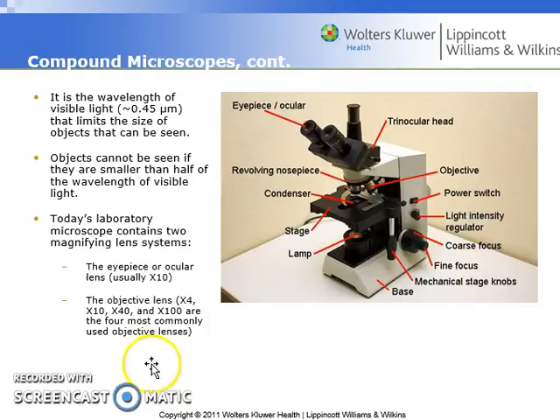So most of these lenses are especially beneficial to allow us to visualize the bacteria that's situated on the slide we're interested in. But we can't visualize anything if we don't have a wave of light that's going to shoot through the specimen and focus it into our own eyes through all of these structures in the microscope, allowing us to make the specimen visible.